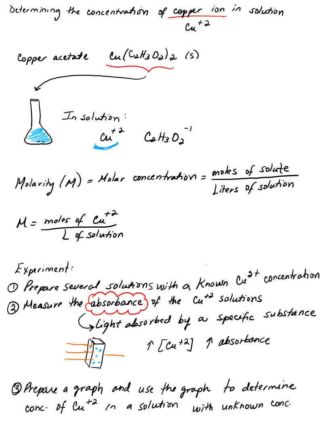And you see how I have 3 lines, and then after the cuvette containing the copper, my blue dots, I have only 1. From the light that is coming into the cuvette, some of that light is going to be absorbed by the copper that you have in solution. So that's what you're actually measuring, how much of that light is actually absorbed by the copper.